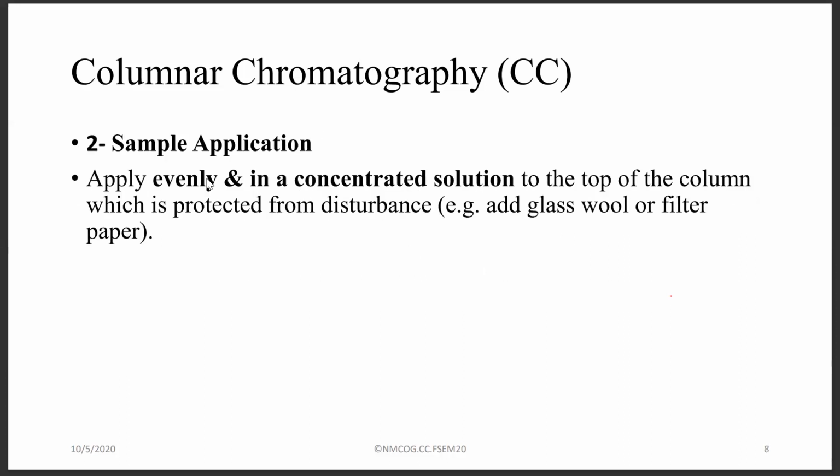And then the sample should be applied evenly. How do I explain it? It should be even throughout the diameter of the column that we're using. The sample itself should be evenly concentrated and even in the amount which we apply.